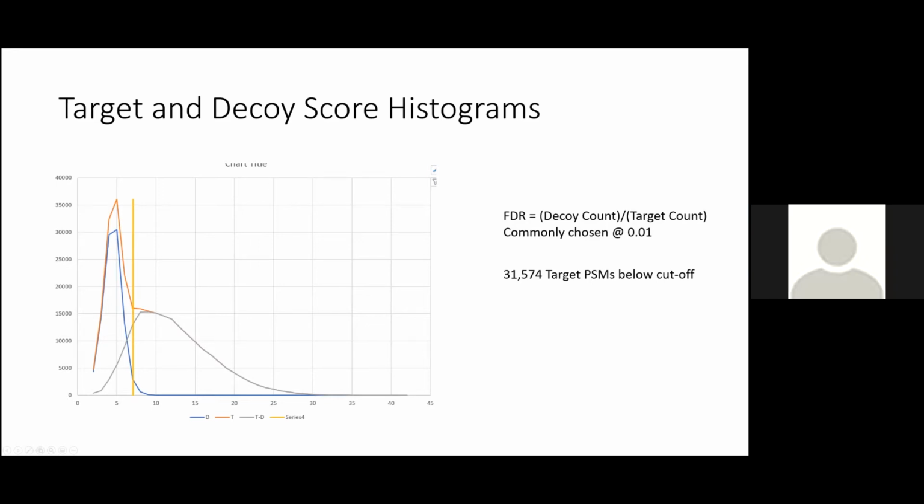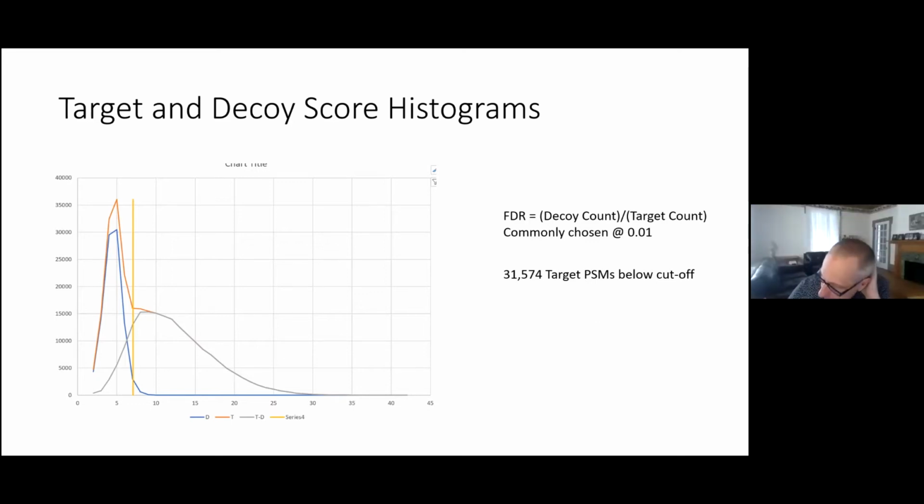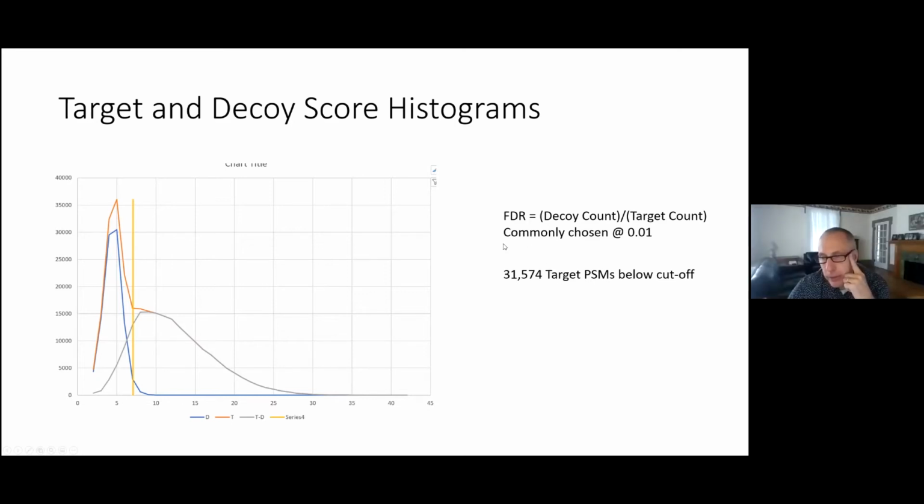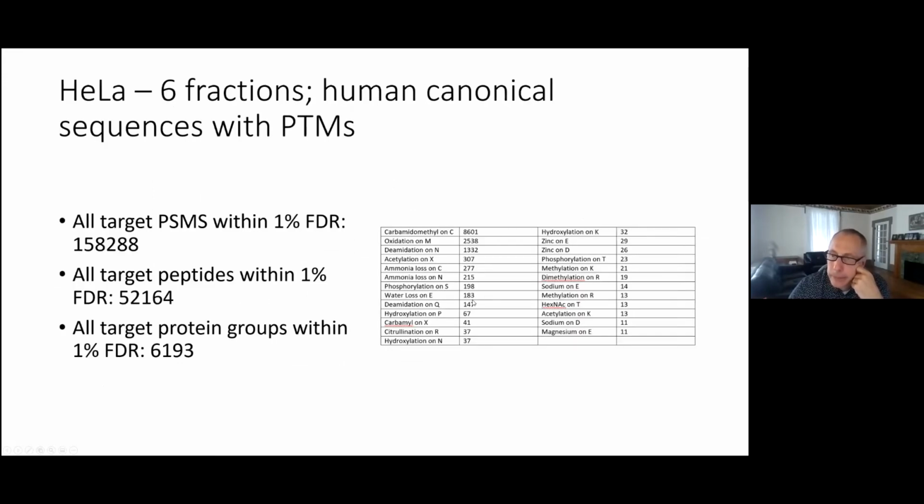Yeah, a good one. So what if you were to do the same based on intensities? First question, can you compute the intensity of the decoys? And if you can, do you think it would allow you to have such a clear distinction that you have here? Right, that's a good question. I'm going to show you some data when I get into talking about how we derive individual confidence metrics, where we take into account the intensity. We don't do it at the group level, but we can and do it at the individual assignment level. Okay, thanks.